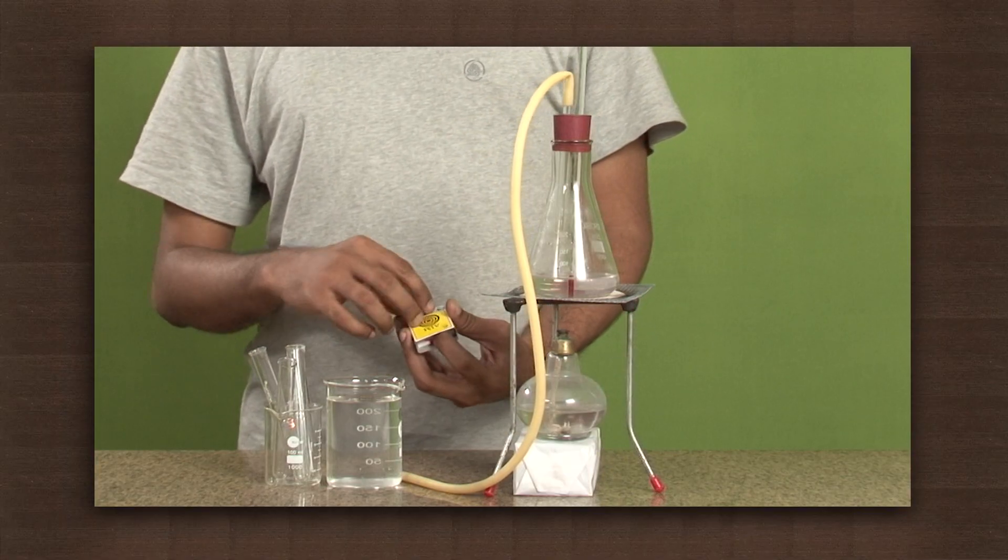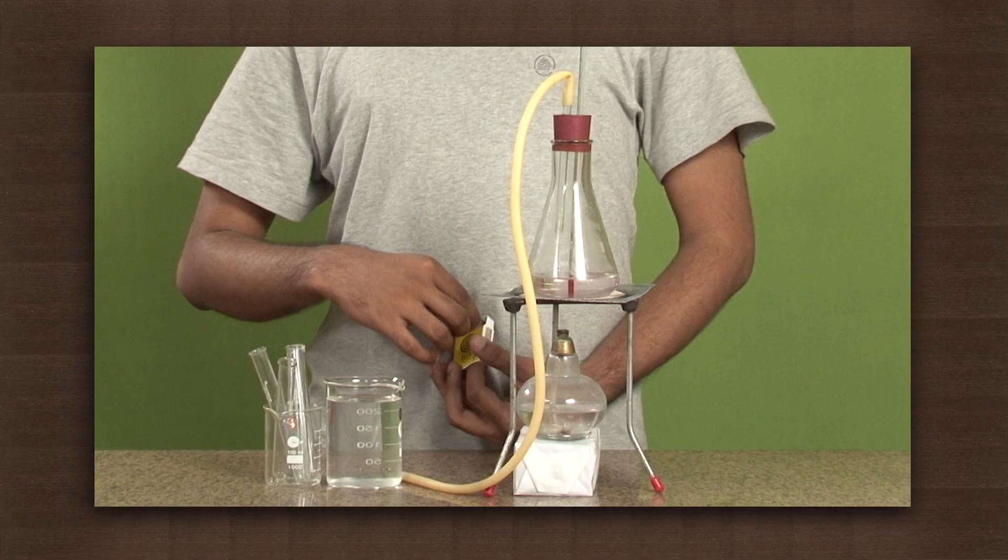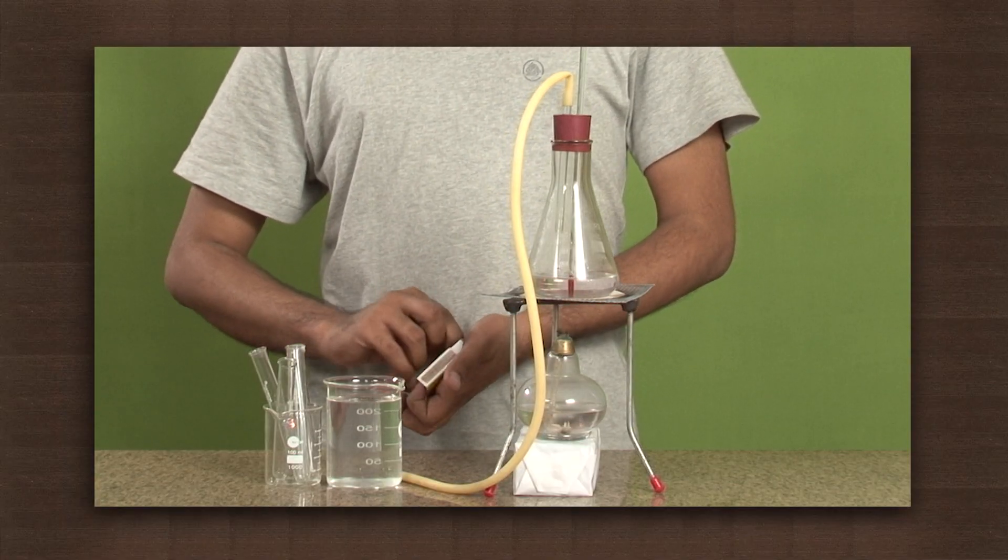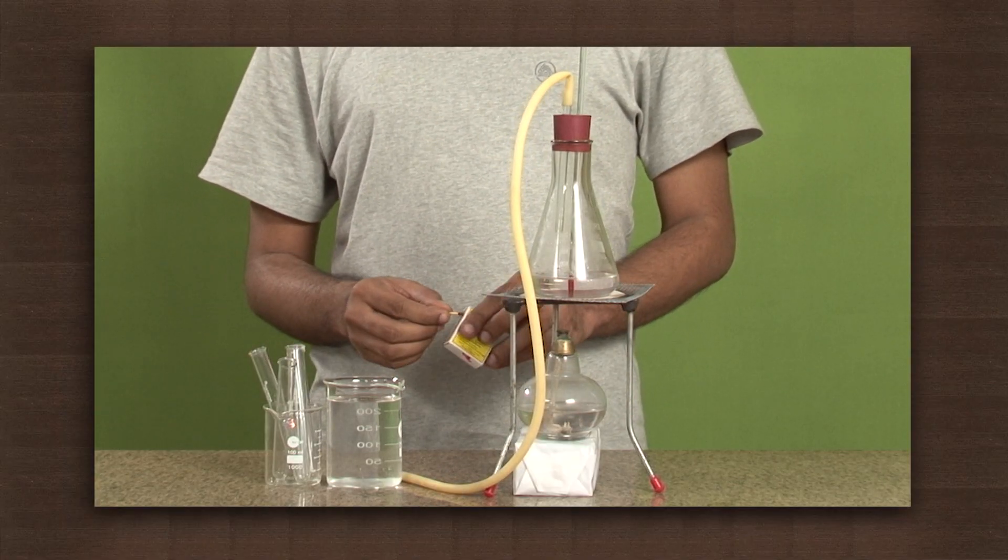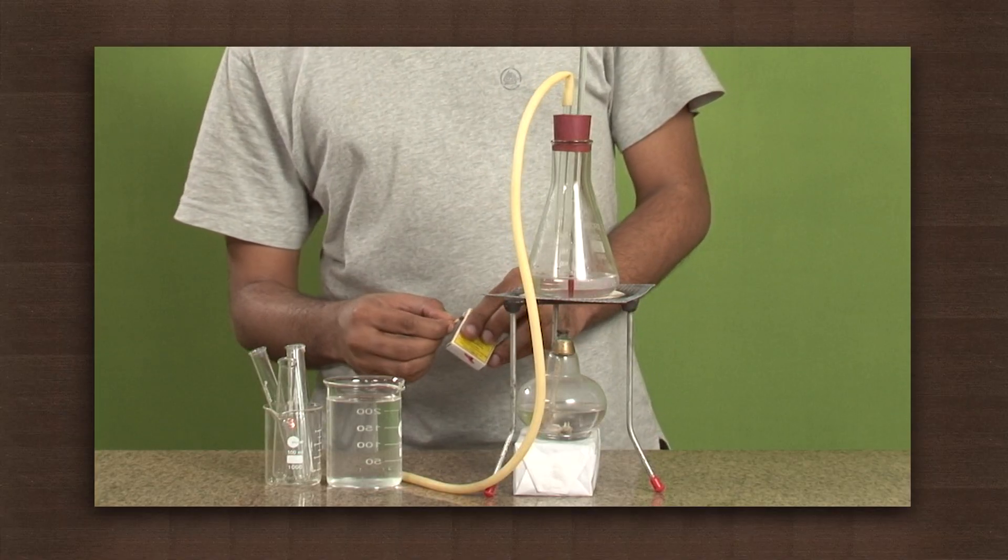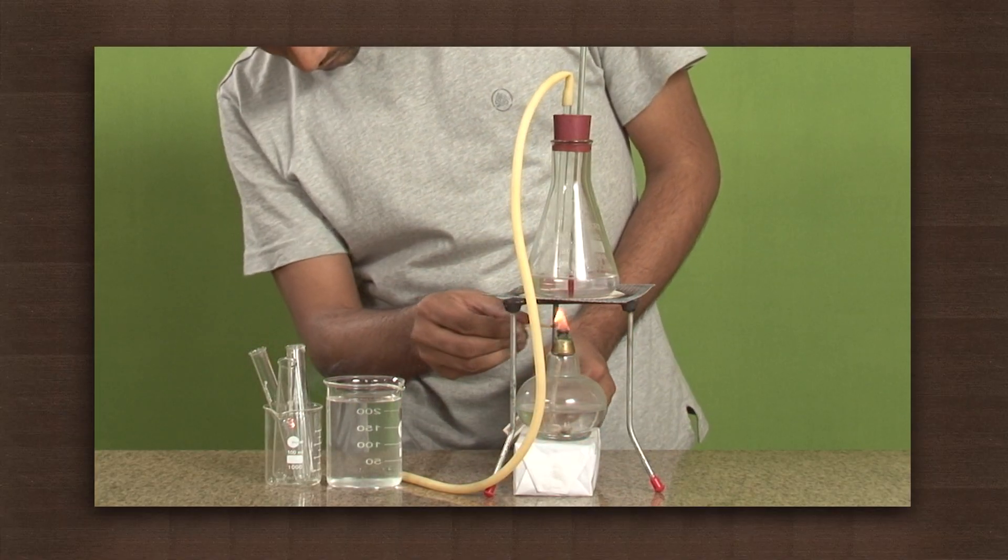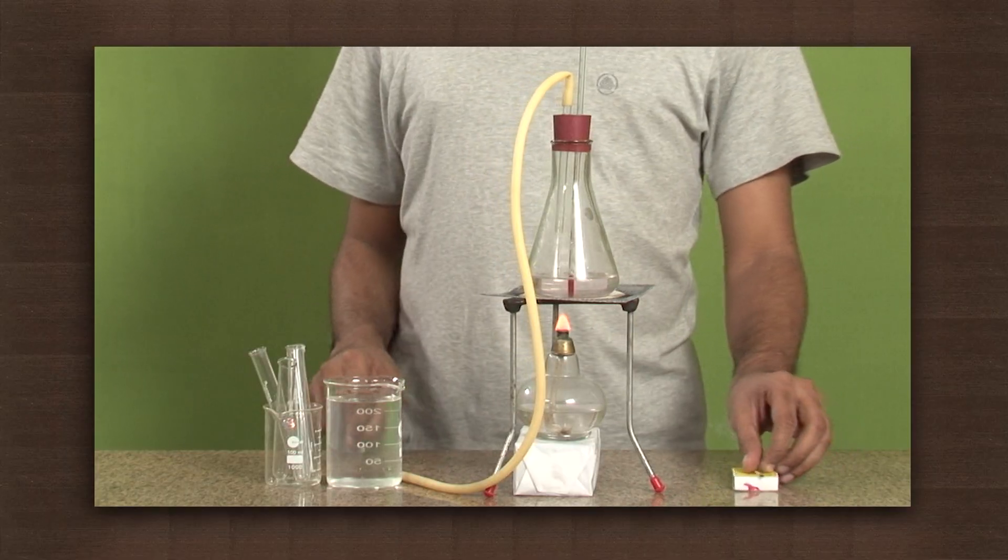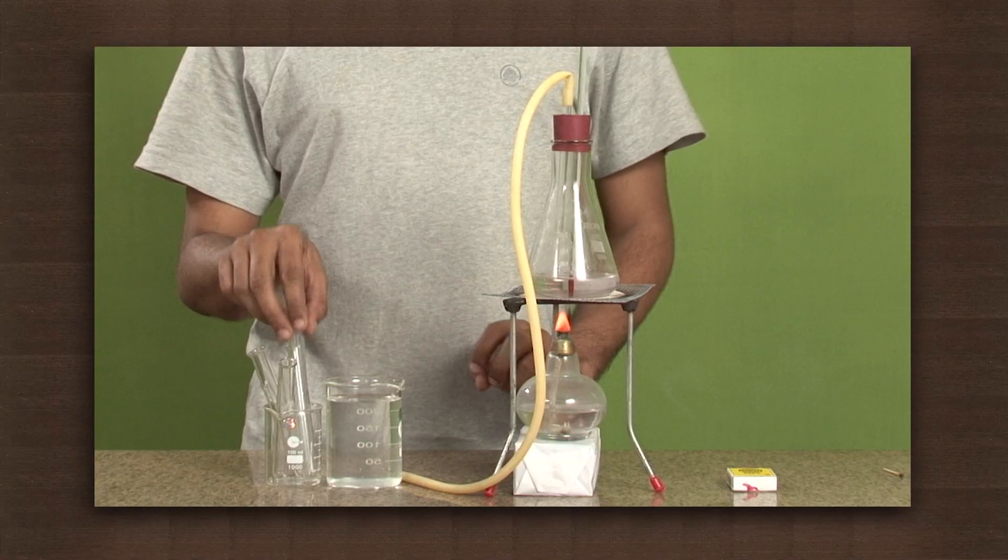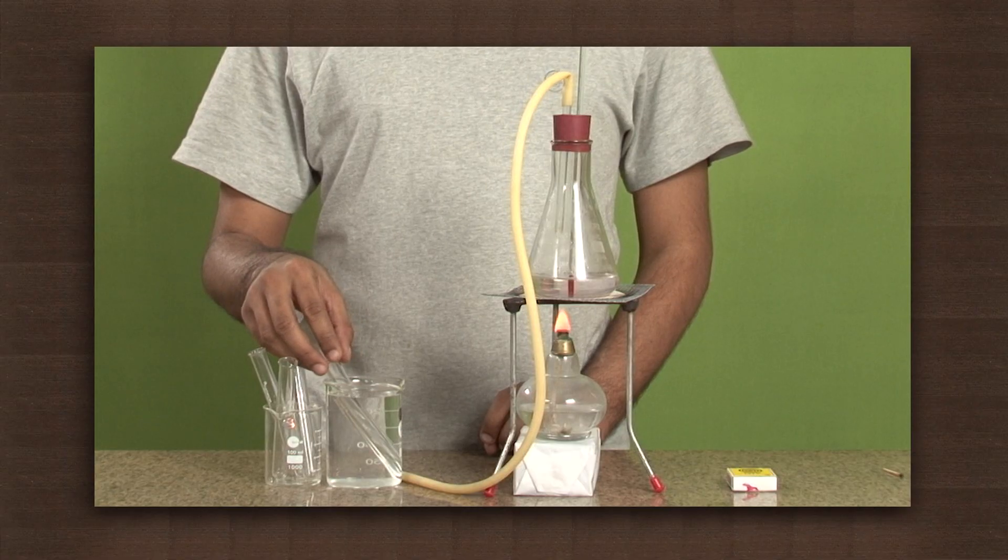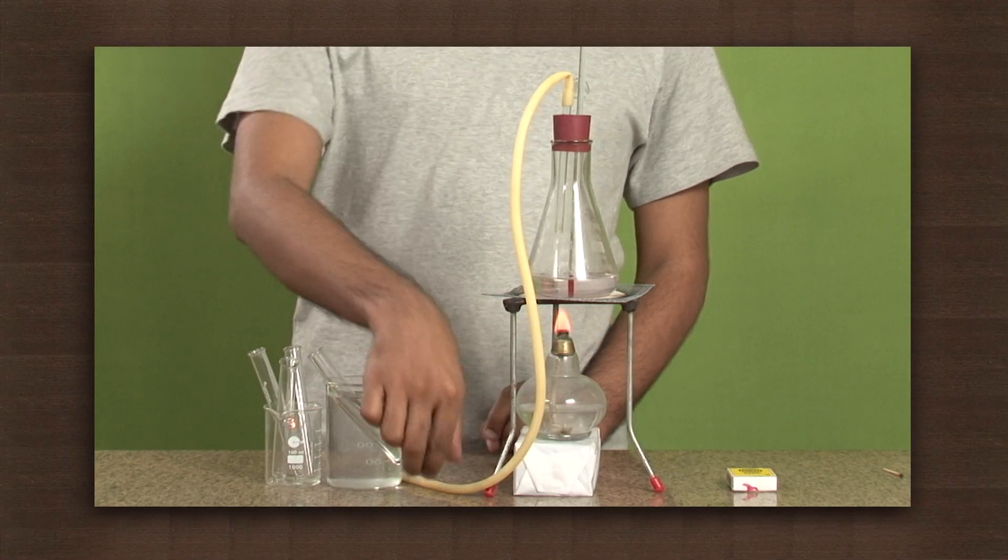Light the burner and heat the mixture in the flask. Place the test tube in the beaker filled with cold water and put the delivery tube in the test tube.